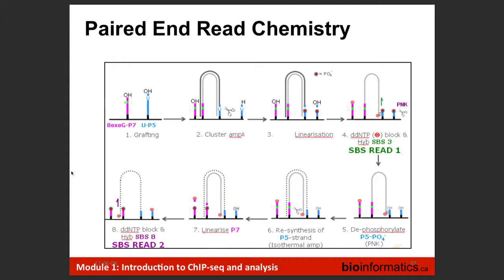So this gets into the question of sensitivity and specificity. As we'll get into, you can adjust how you tell the aligner, like BWA, to do the alignment and how many mismatches it will allow and still place that seed. And as Misha says, you can leverage paired end reads slightly differently. That's not a common application, and I would caution people doing that unless you really know what you're doing. I would just use the default, two mismatches.